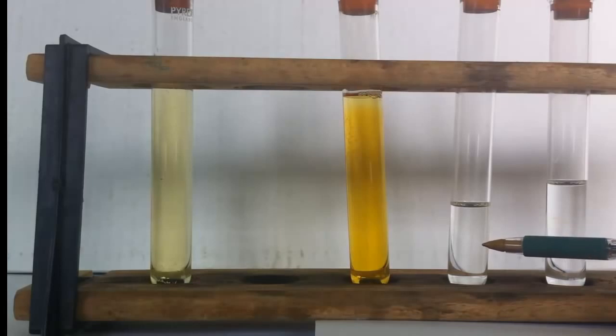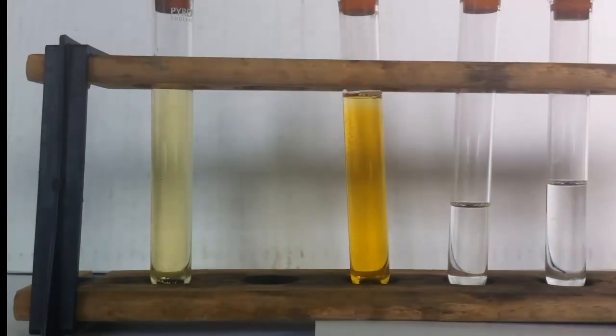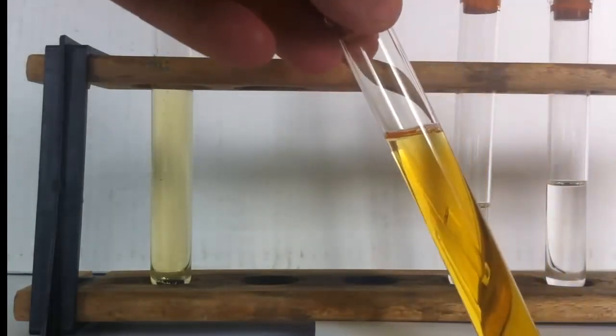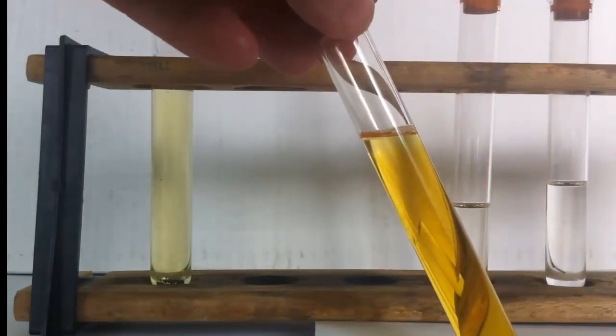So let's take a look at the positive test first of all for the presence of a carbon-carbon double bond. What I'm going to do is take some of this bromine water. Bromine water is poisonous so this experiment should be done in a fume cupboard.